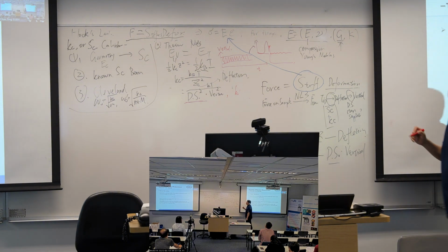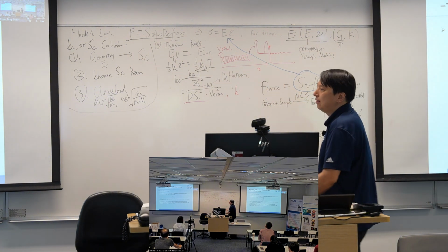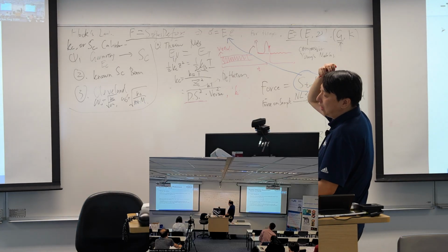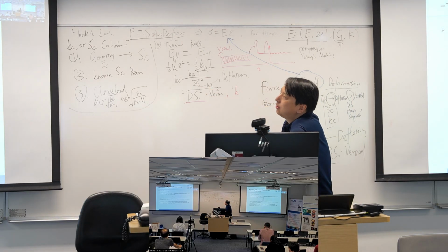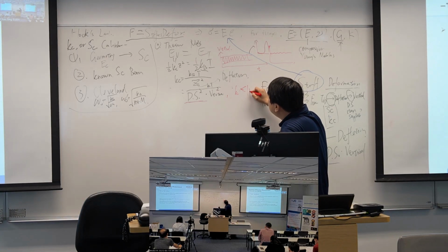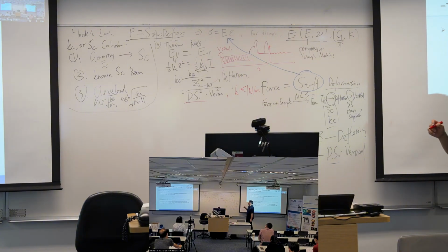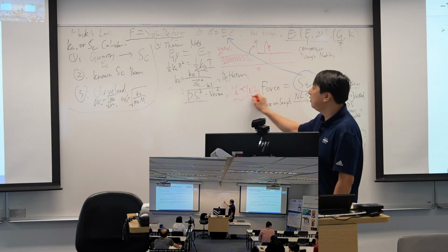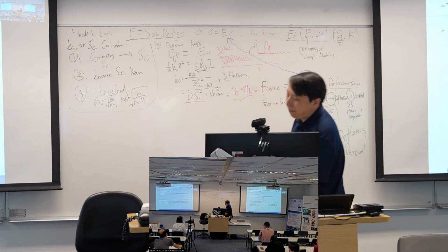For such a weak signal, it's hard for us to obtain its amplitude, and the sensitivity will be significantly reduced. So usually this thermal tune method is for quite small Kc, usually smaller than 1 Newton per meter or 10 Newton per meter, these kinds of softer probes.